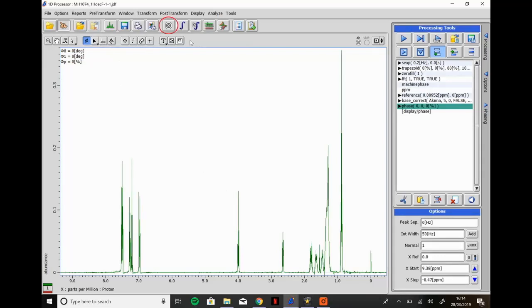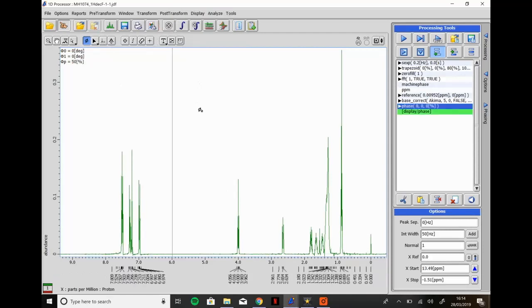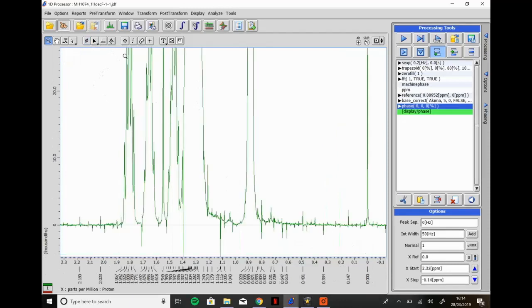Select peaks by pressing the X button on the tab, as can be seen. The program registers every peak available, and overall this looks a little messy. Clean this up by changing the baseline threshold.